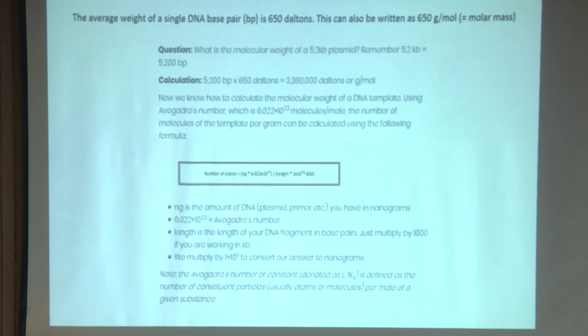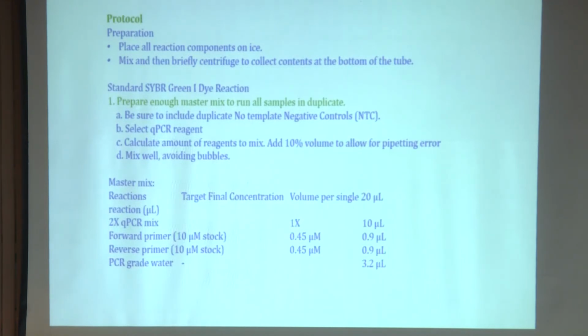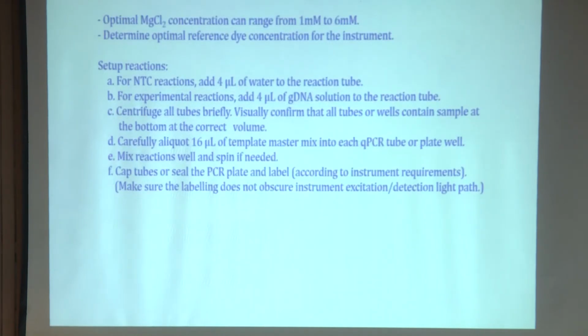And of course, as I said earlier, you should be able to quantify the number of copies present in each amplicon which you are going to use for your standard curve. All those details I have given in this. The protocol has to be prepared for each gene of interest, and used carefully for each gene you are going to put through your qPCR analysis.